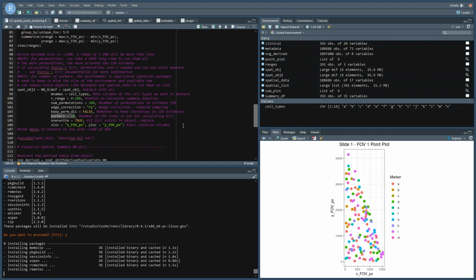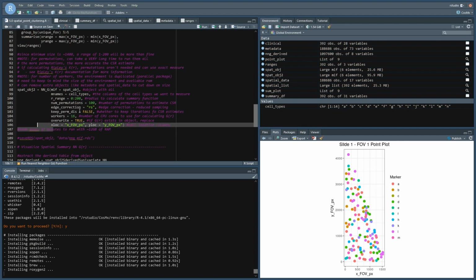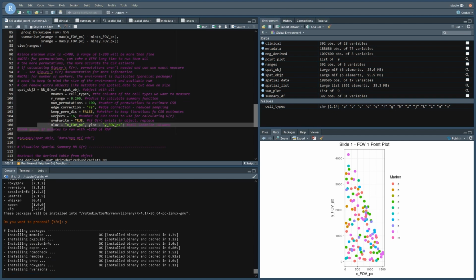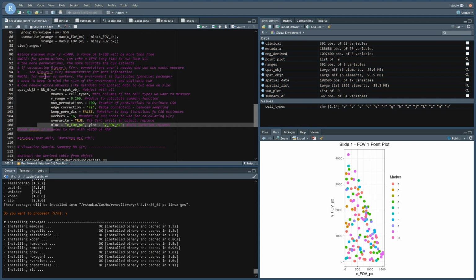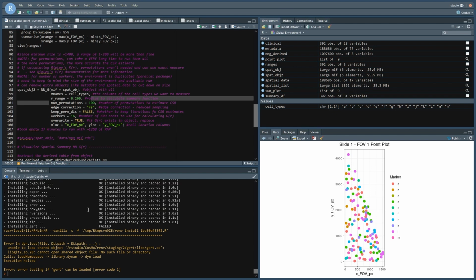You can imagine with a single core on Windows, it would take much, much longer than 17 minutes versus 16 cores taking that long for 100 permutations. The newer version of SpatialTime is much faster.